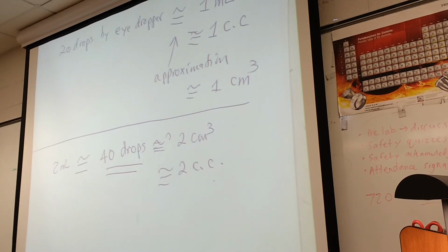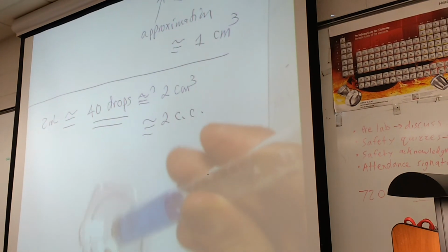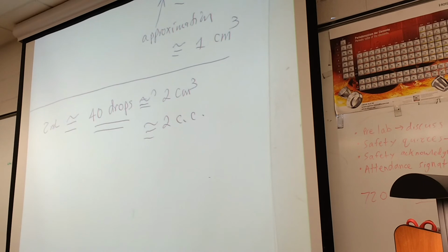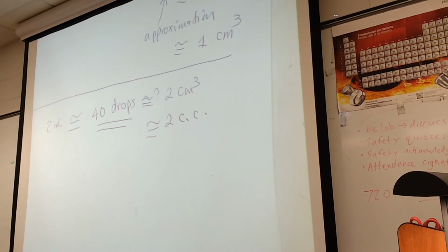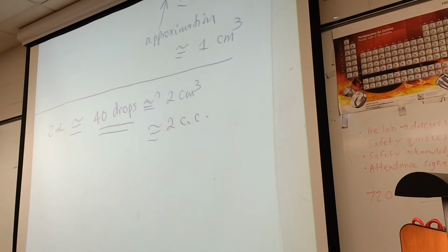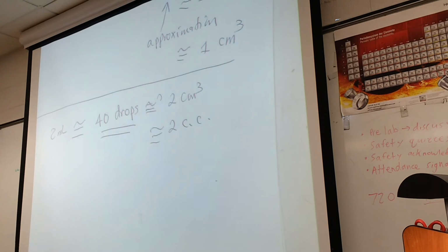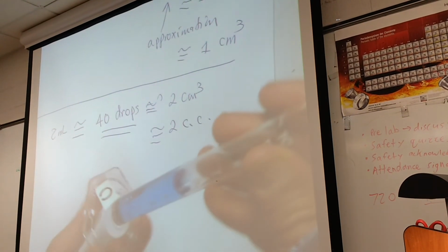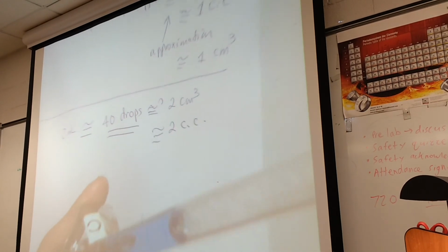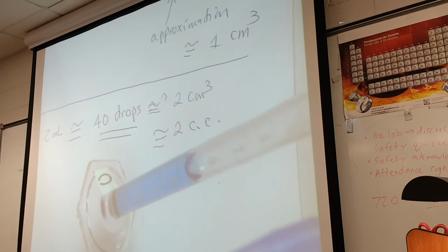Now, let's look at each of those. We did the mass, we did the length, measurement of the wooden object, correct, and measured its volume. Now, how about, we don't have the centimeter cube, but we have to have it in milliliters. So we want to measure this. Can you see it now here? Maybe I have to make it bigger a little bit. Here it is. So I want to measure this.